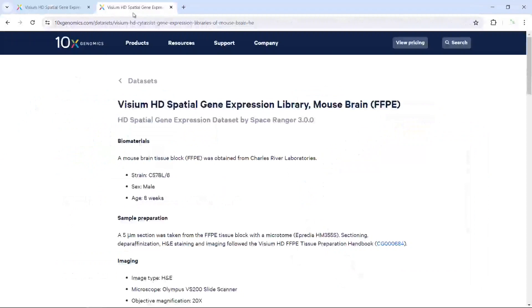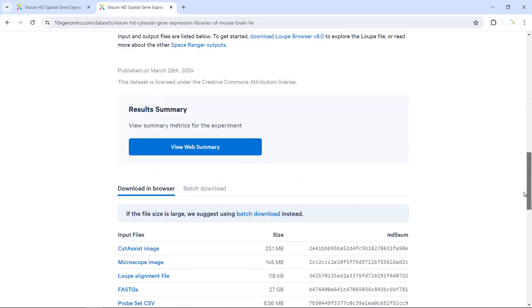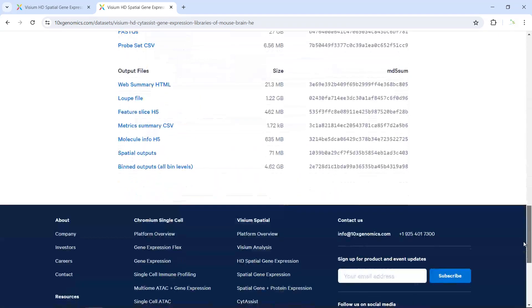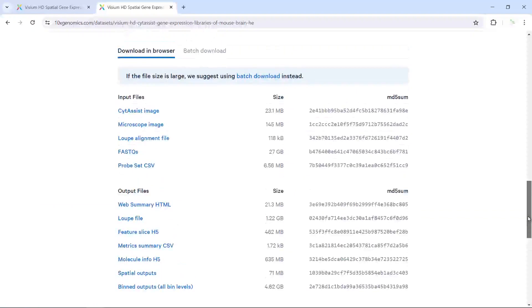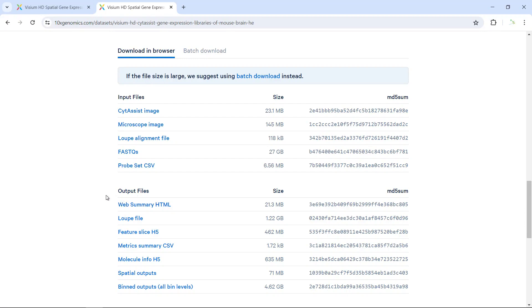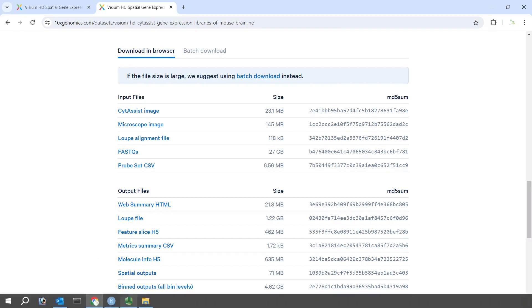I'm going to use the mouse brain FFPE dataset for today's demonstration. You can scroll down to see the data and download the output files to your computer. I've downloaded all the output files already. Let's have a look at the output files in my folder.